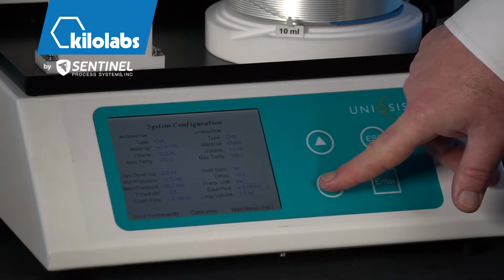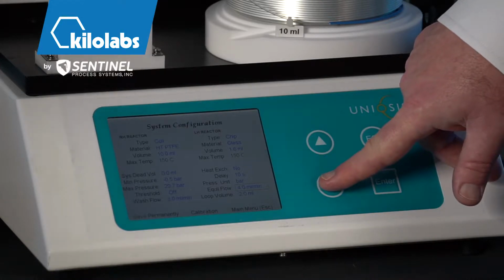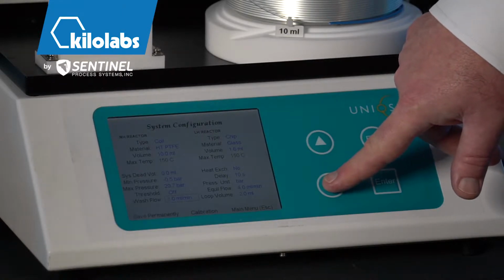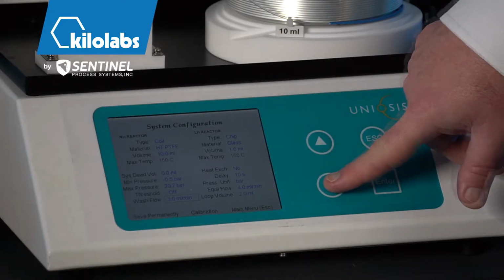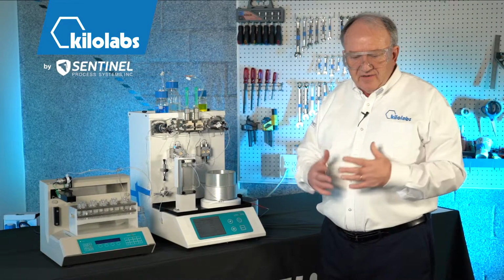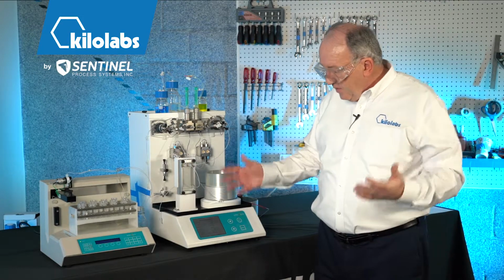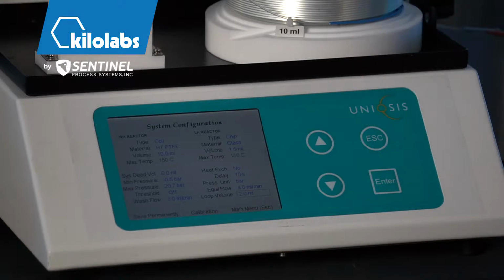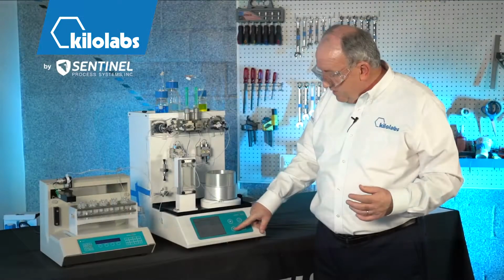The equilibrium flow is a flow rate that is used, in between experiments, to bring the system up to temperature before the experiment starts. A wash volume in between experiments if you want to rinse out the machine, and of course, if you've got a reagent that's really aggressive, you may want to increase that volume to 20, 30, 50 ml, whatever you want. And the loop volume is the volume set up for these loops. We're not using these loops today, but that's a parameter that you can set.